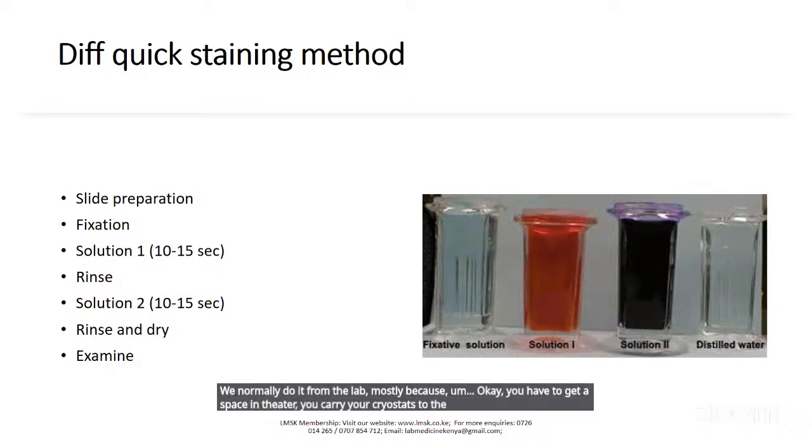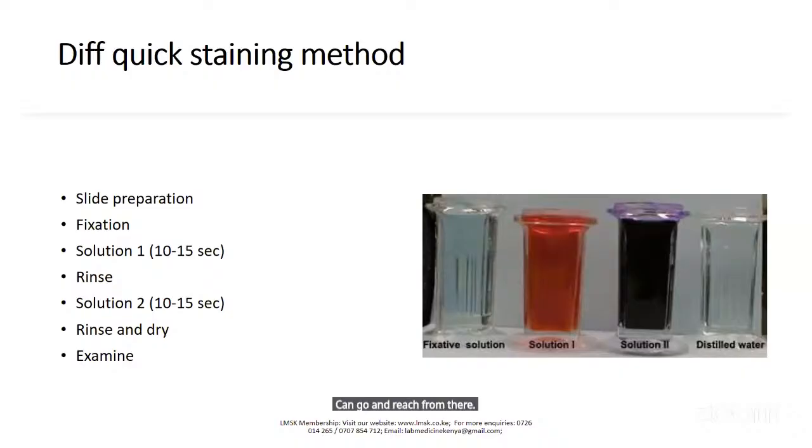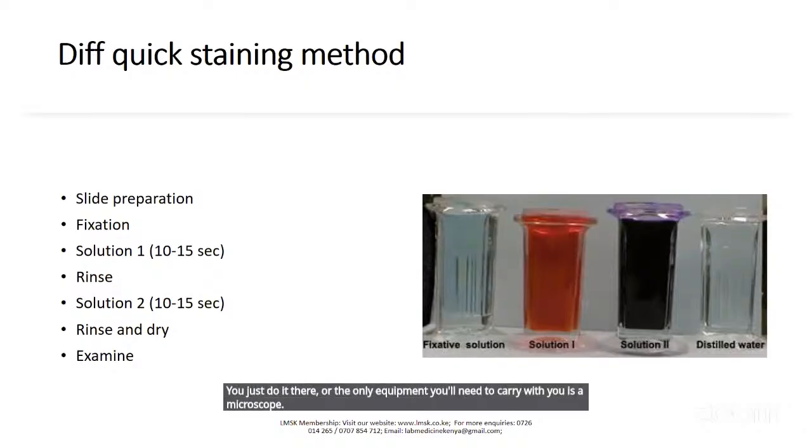If your theater setup has that provision, you can go and do it from there. But we normally do it from the lab. That's why I said you have to have a porter on standby. But for ROSE, the cytological techniques, you just do it there. The only equipment you need to carry is a microscope.